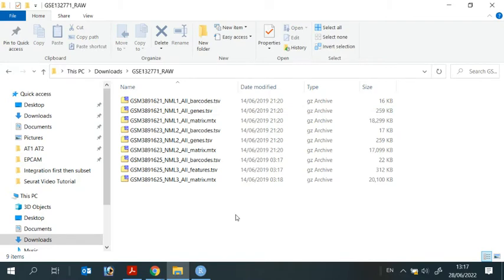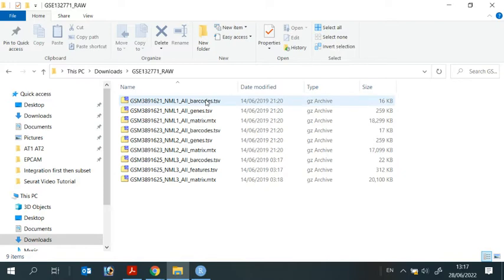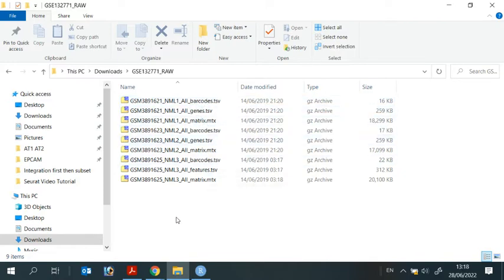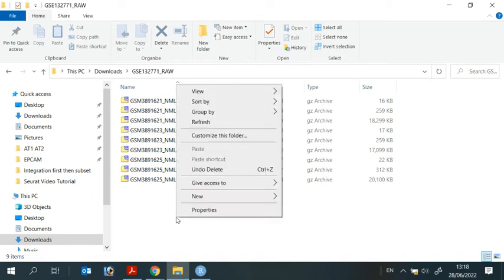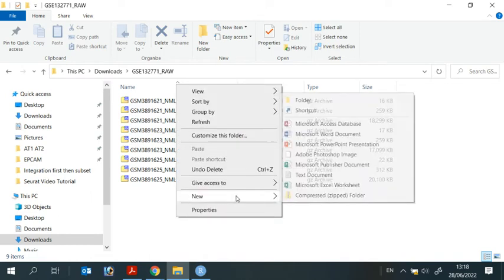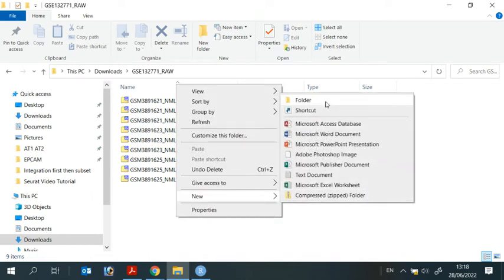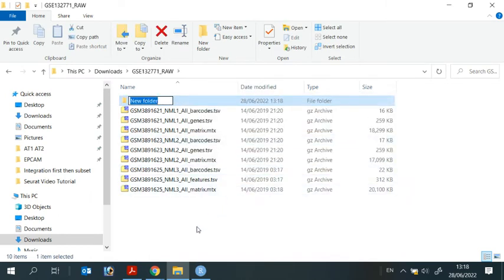We can open the file. You can see there are nine files. Three files for each repeat. NML1 has barcode, genes, and matrix. So we need to do some reorganization for the data.